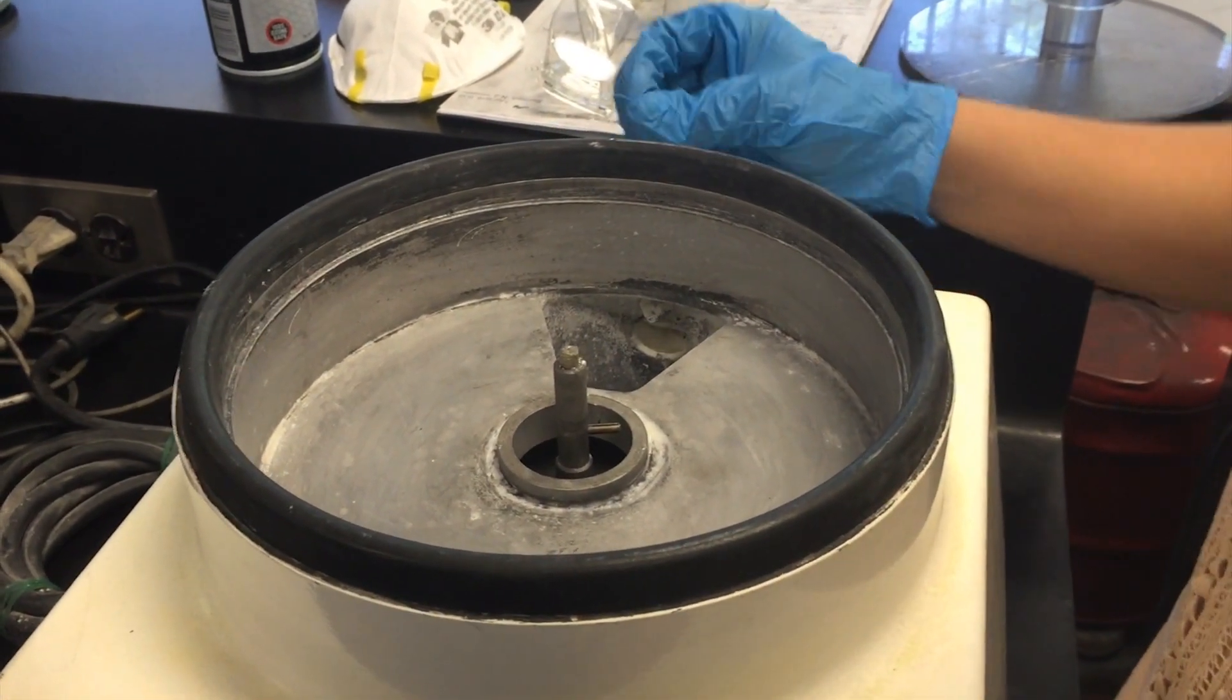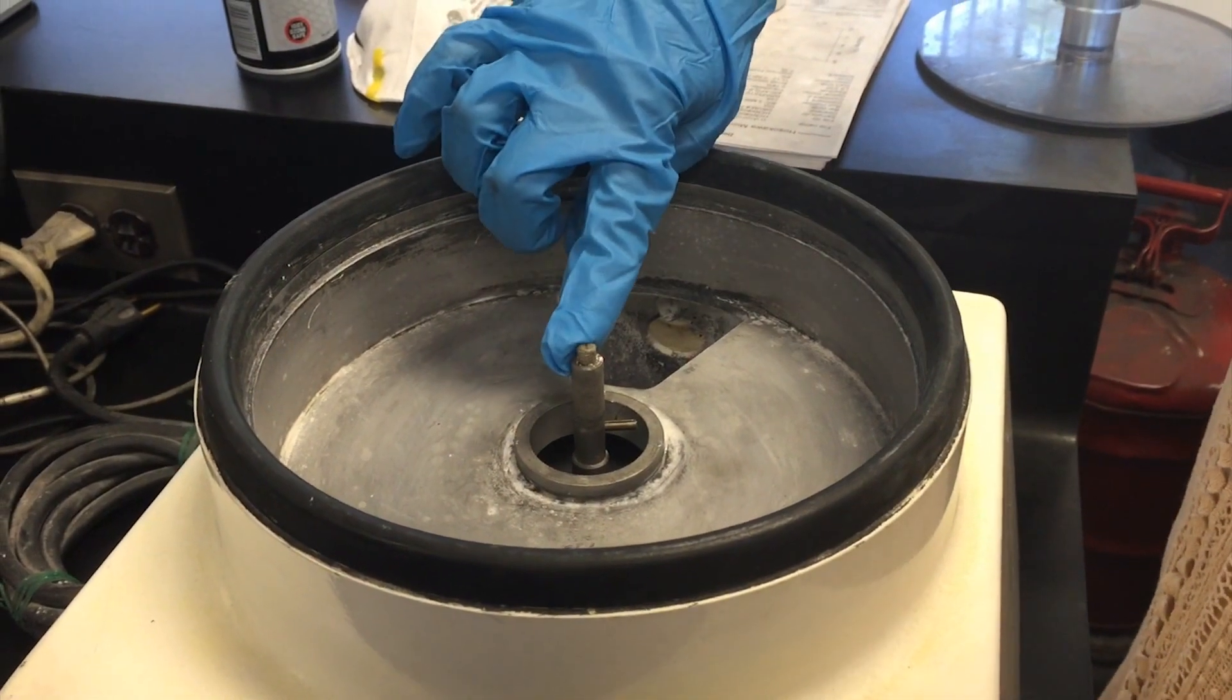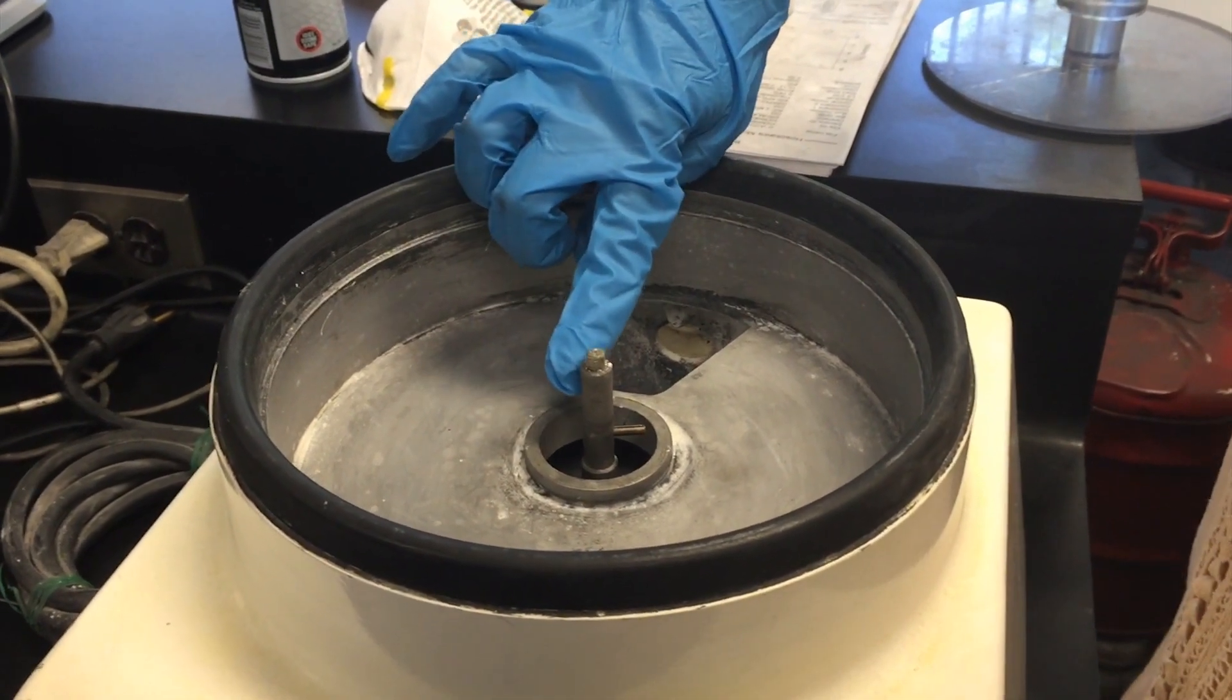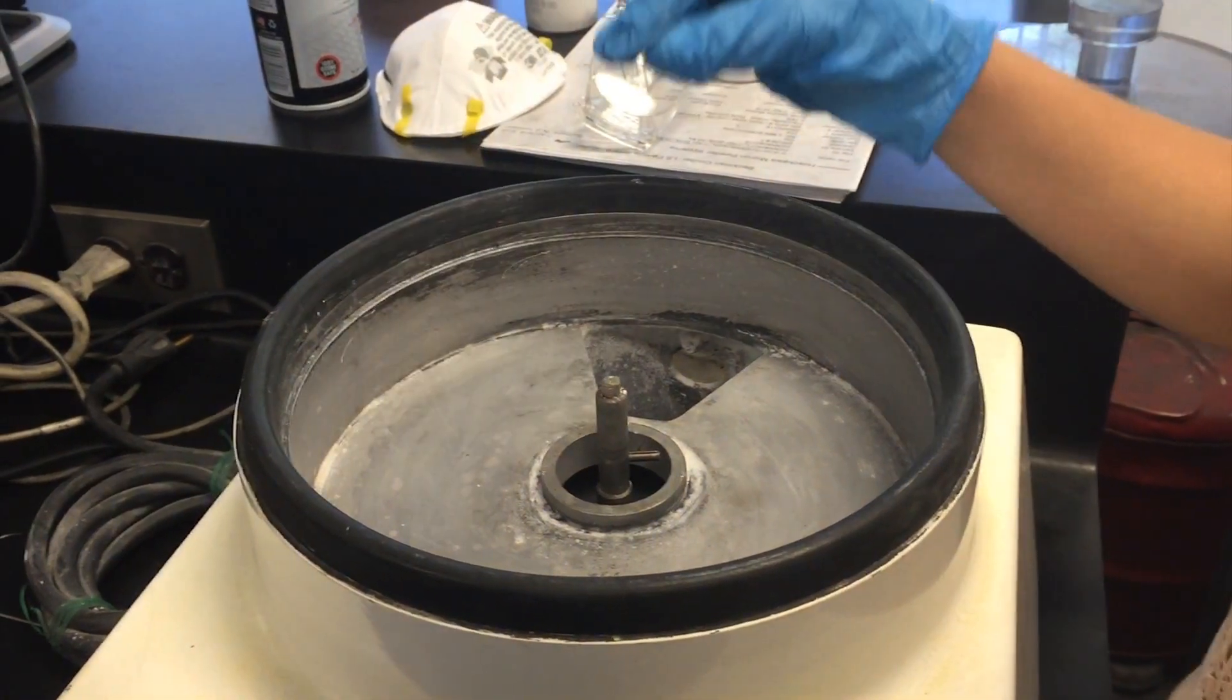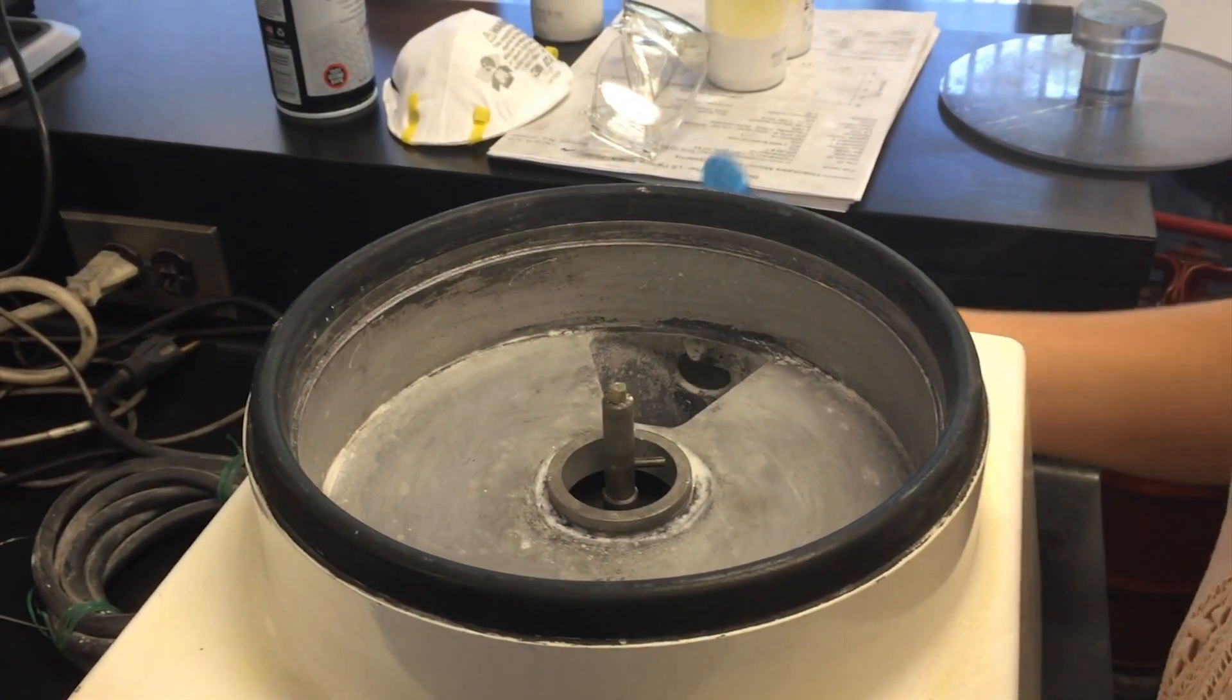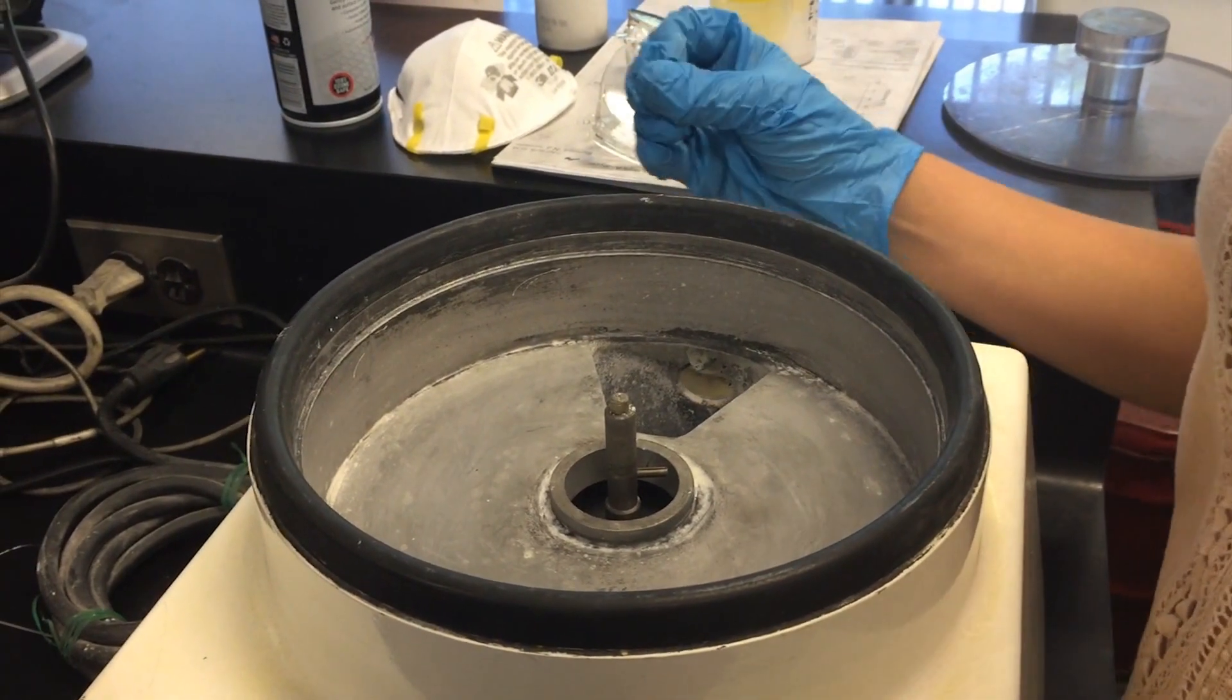Next, we're going to double check the height of the nylon screw that's located on top of the motor shaft. This is going to make sure that it gives the wand proper height and distance between the mesh and the air wand itself.